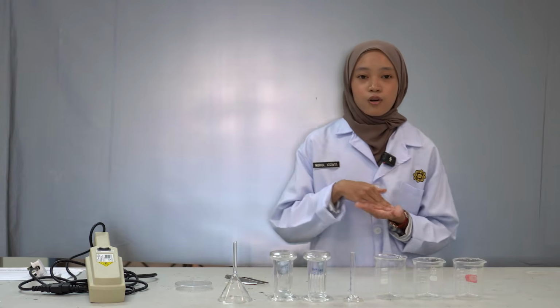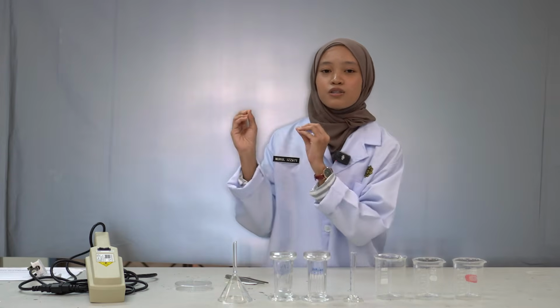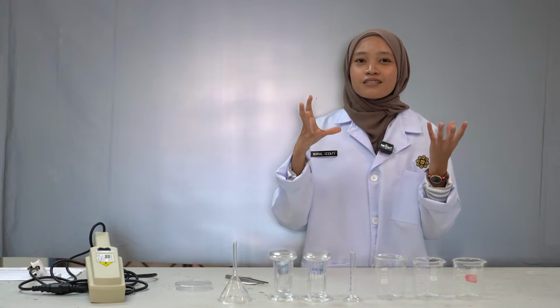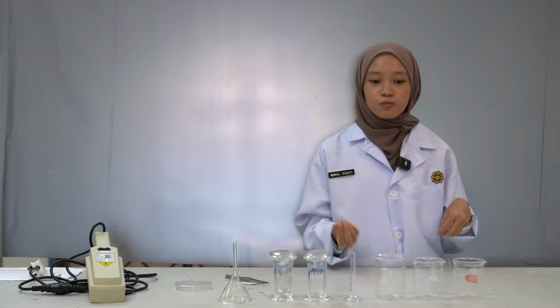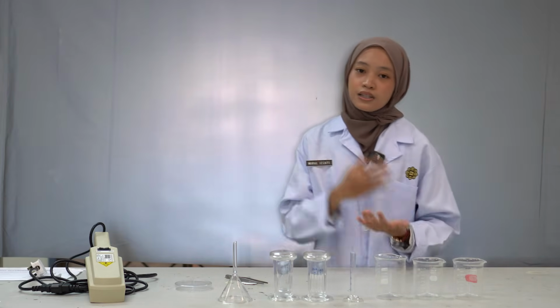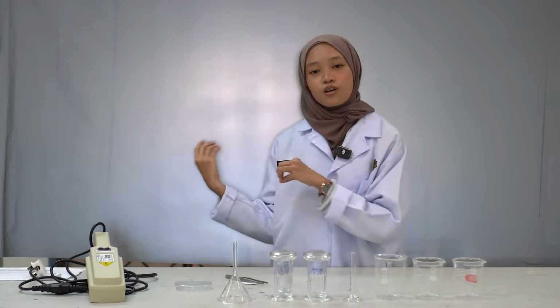After the TLC is run, if the new spot is the same distance as the standardized paracetamol, then it is verified and purified. And if another spot is located on the TLC, that means impurities are present and they need to bring the new batch for more investigation.